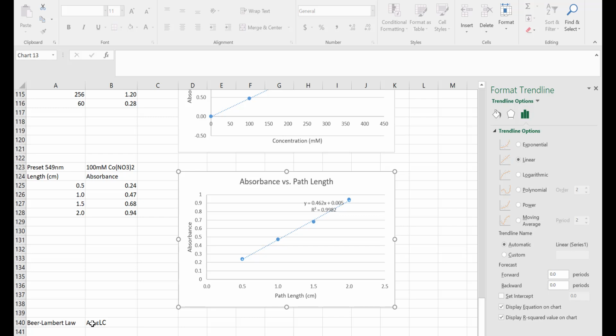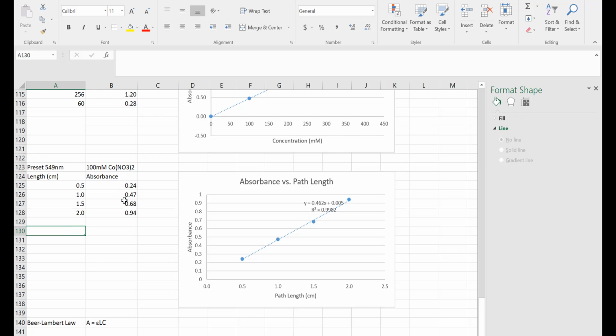Okay. A couple other things I want to just introduce to you while I have it on the board here. Sometimes you might be interested, as you look through a long set of data, you might want to really quickly find your maximum value, really quickly find your minimum value. Just a little spin-off here. Let's say I wanted to, at a glance, see which one here is the maximum. Excel is actually pre-programmed in with some common functions.